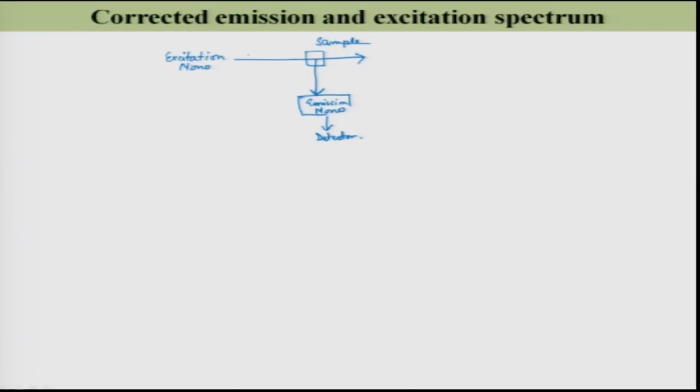As I said, you already have a reference channel over here. This is my reference detector, and I named this detector S1 and the reference R1, the simplified version of that complicated fluorimeter.